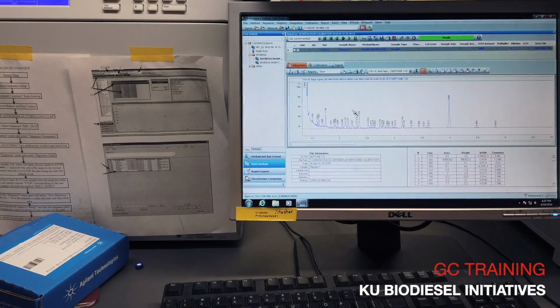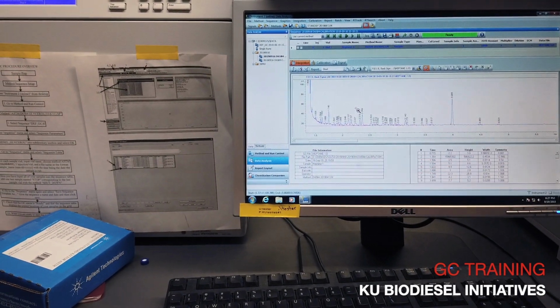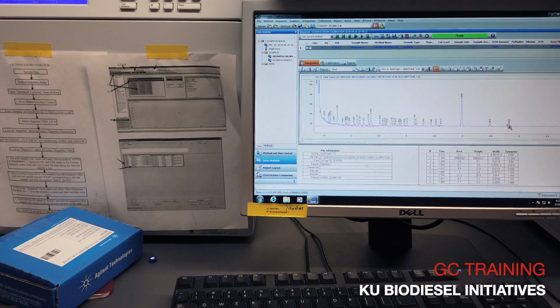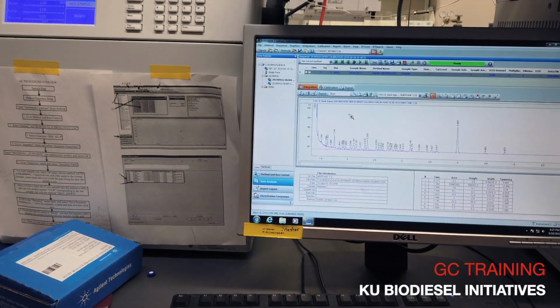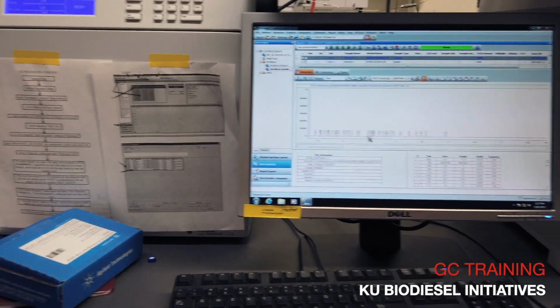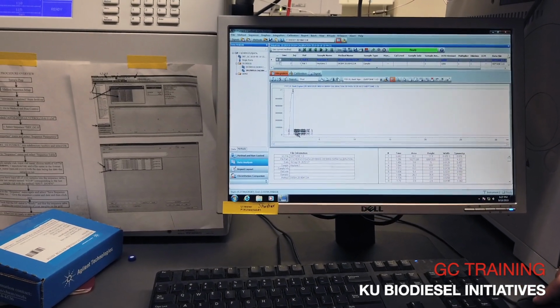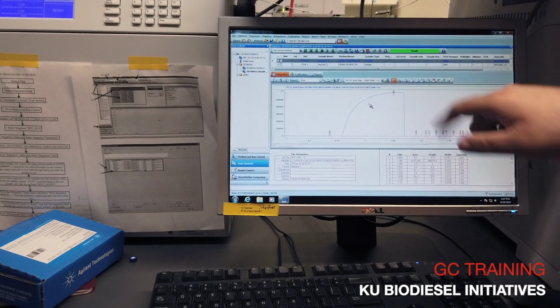It's not very high concentration because this is like 100, so that's very little. The problem is that this might eat some of the compounds that we're looking at. So we'll see. Hopefully not. But yeah, this is also an important aspect of it. So see, it looks like a shark fin. That's what you want it to look like.